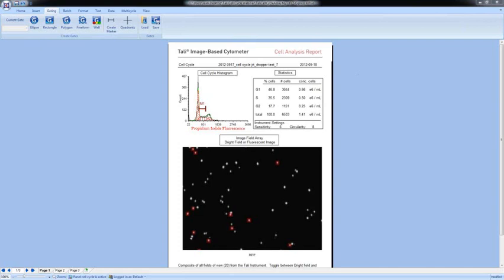Great. And we had a question about how well the model will work with samples with 2 cycles, such as a mixture of tumor and normal samples. So in FCS Express, there are many different cycles that Multicycle can detect, including greater than 1 cycle of analysis. I would recommend that you just download a demo of FCS Express and try the data in there. If your 2-cycle data fits the model, you should not have any problems modeling that data in the software.